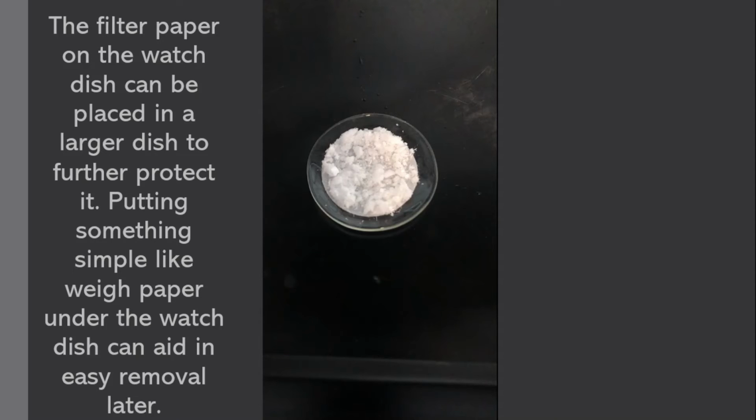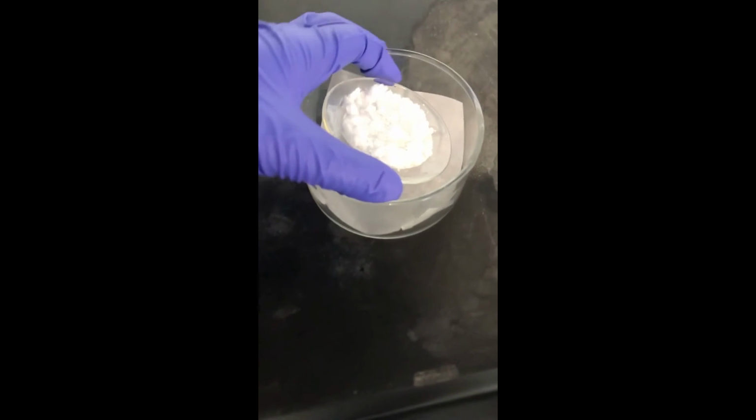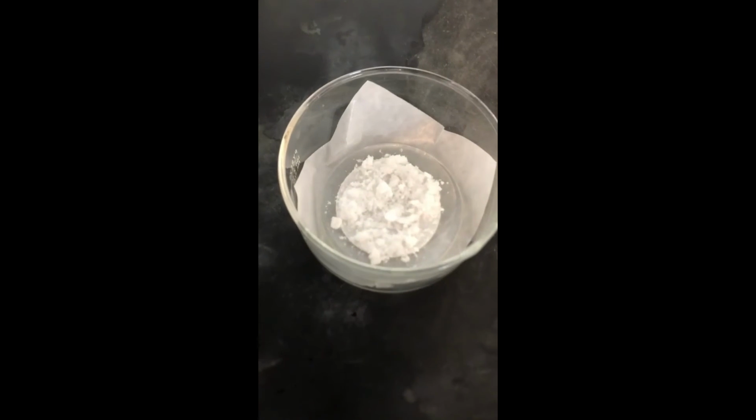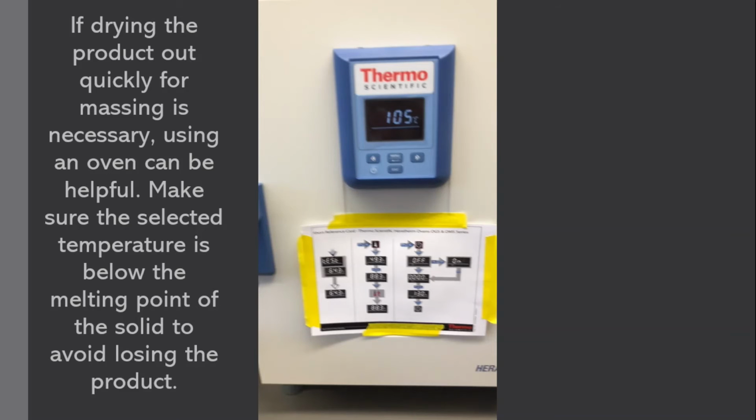And when you're drying, you're going to put it into the oven, but you want to put it on the filter paper and then into a larger dish so that it's more protected. I generally use something like weigh paper to put underneath my watch glass so that I can easily remove it after the drying. And when you're drying, you just want to set that oven to the right temperature. So I set it to right below the melting point of my product, at 105 degrees. I wanted to make sure I didn't lose any of that solid product by it melting into the filter paper. I want it to be easily removable off of the filter paper.